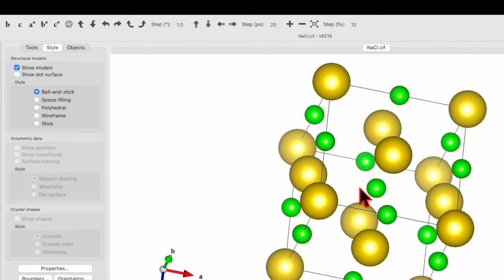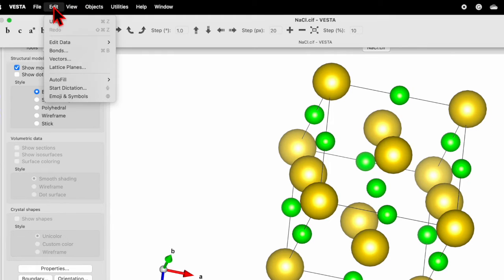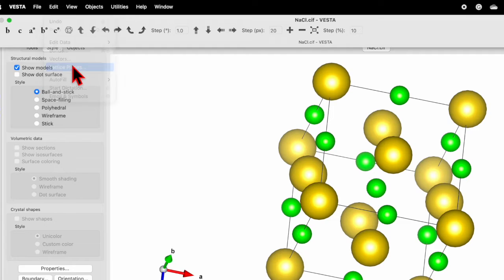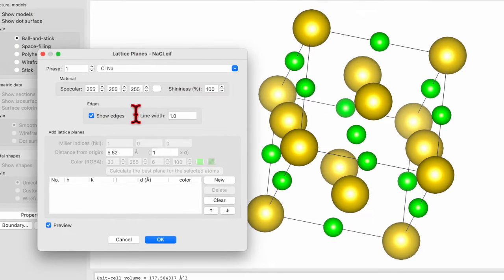Okay, so this is the unit cell of sodium chloride. Now let's go and click on Edit. Over here you will find the option for lattice plane. Click over here. In the bottom window you can click New.